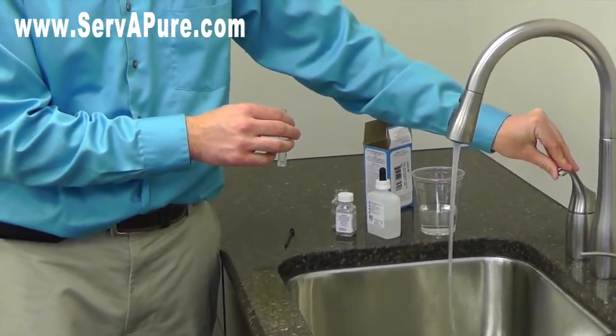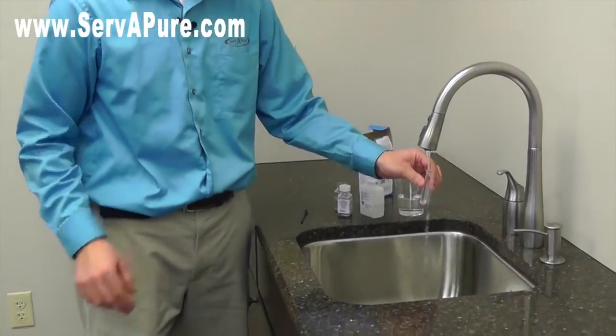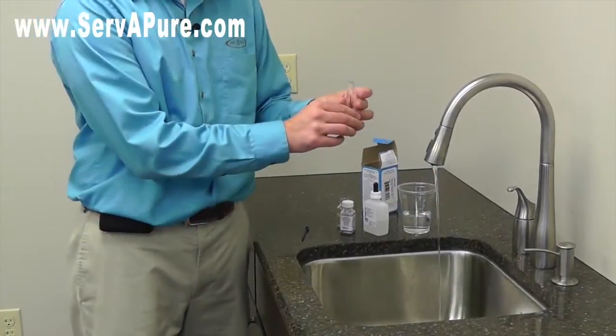We'll slow it down and fill up our test bottle. We'll fill it a couple times to give it a good rinsing, and then fill it all the way up to the top.